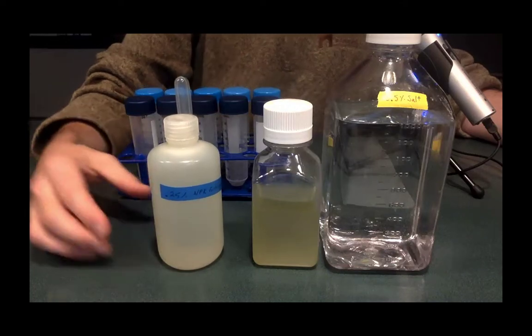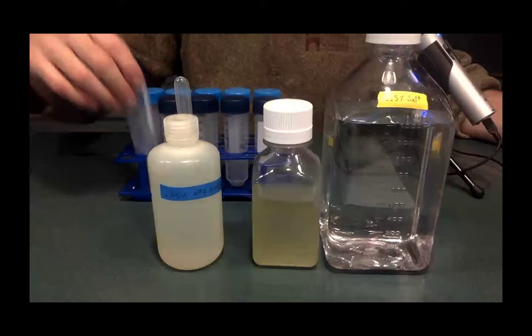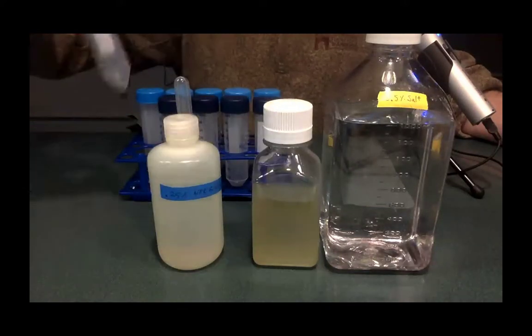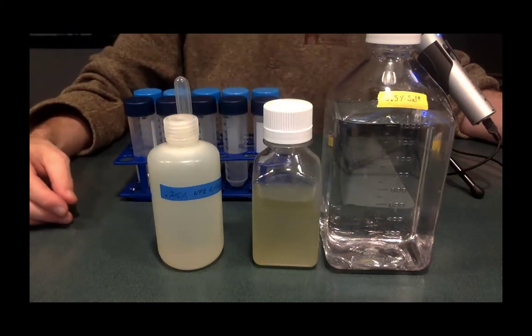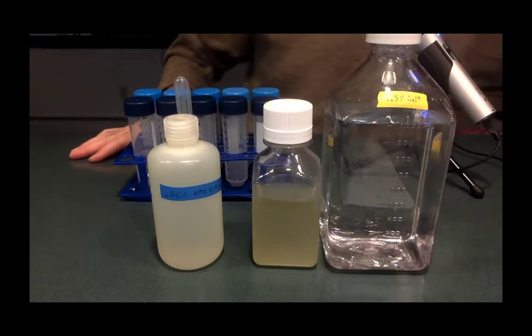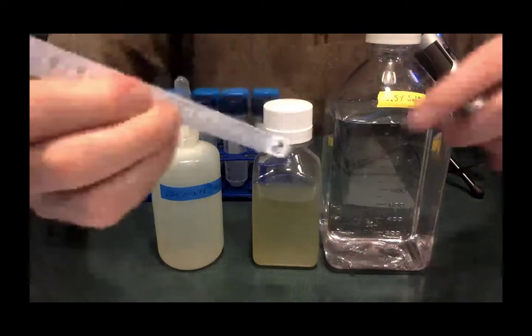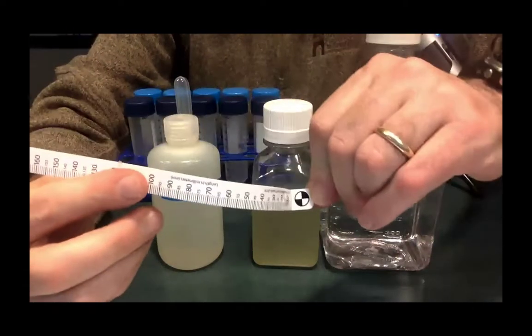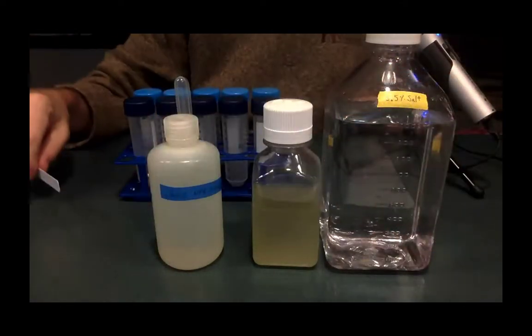So I've made that. And then I've also got my Falcon tubes. These are conical centrifuge tubes, and they are the 50 mil size. So they've got the graduations up to 50 mils. And then I also have this device that's referred to as a mini Secchi disc. And it looks like this. The mini Secchi disc has this little thing on the bottom that is going to be for reading, and I'll explain how this is used after I've done the setup.